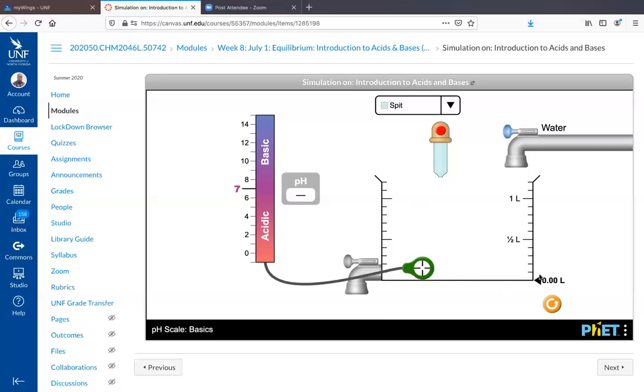And then the volume here will change to 0.1. You see, it's changing to 0.1. That's what I need to, oh, I overshot it. So what I'll do is just drain that and it comes back to 0. So you've got to be careful until you end up with 0.1.